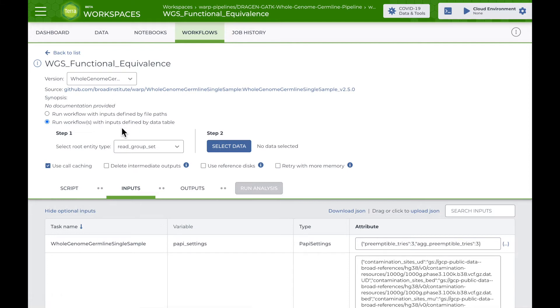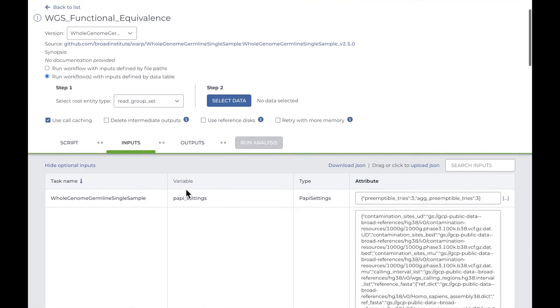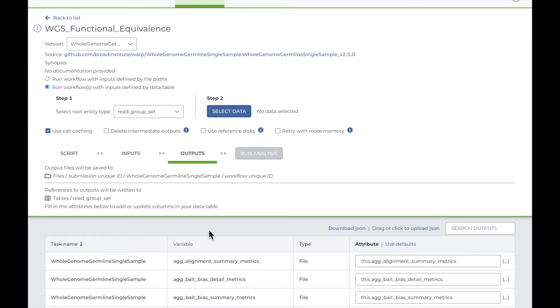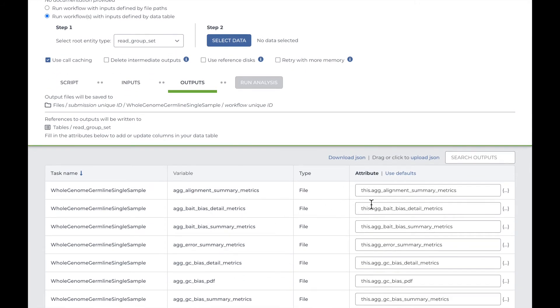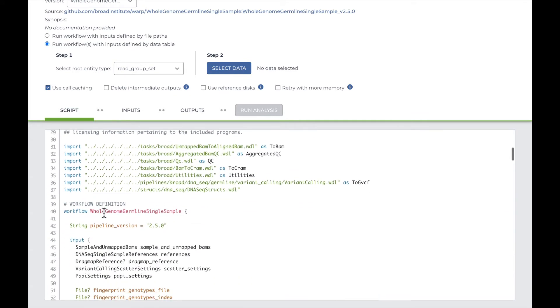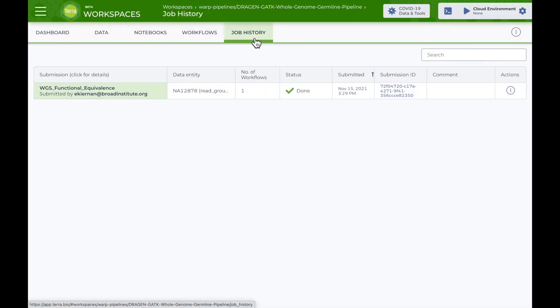The setup page is also where I can choose data from a data table, or configure the workflow inputs and outputs, which are at the bottom. The inputs are already configured to pull sample and reference data from different Terra data tables. On the outputs tab, the workflow is configured to write data back to a Terra data table. On the script tab, I can view the actual workflow script written in the Workflow Description Language, or WDL. When I'm ready, I can run the workflow and monitor the progress in the job history page. If the run is successful, I'll see a green check.